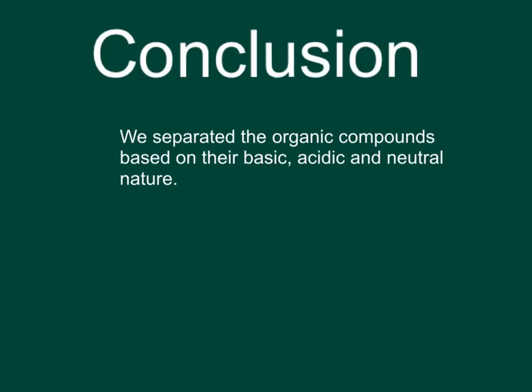In conclusion, we separated the organic compounds based on their basic, acidic, and neutral nature. After these experiments, we also learned how to deal with small amounts of compound and that we need to be more careful in handling them.